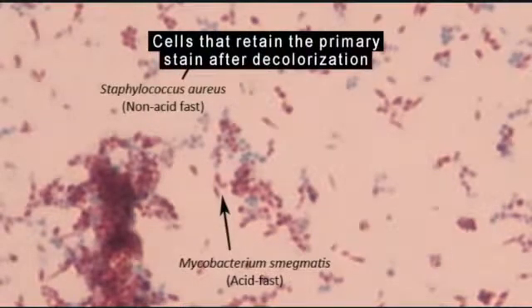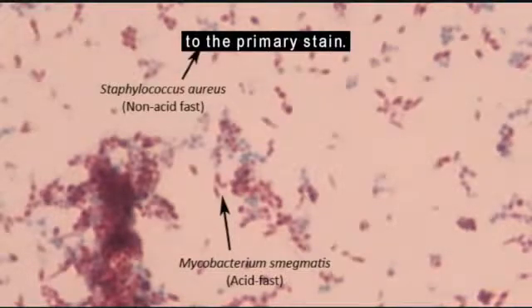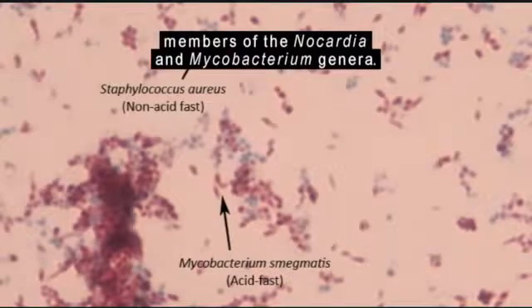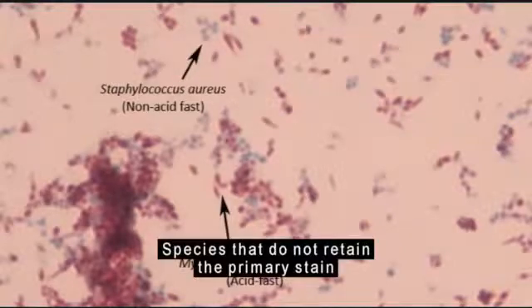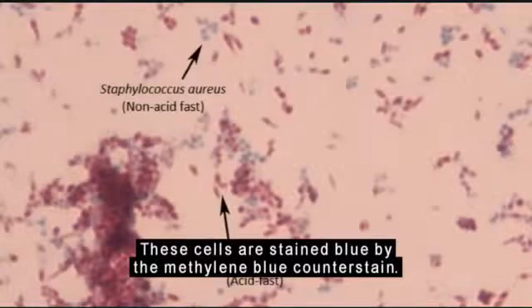Cells that retain the primary stain after decolorization are called acid-fast because they hold fast, or tightly, to the primary stain. These acid-fast bacteria stain red and include members of the Nocardia and Mycobacterium genera. Species that do not retain the primary stain after decolorization are called non-acid-fast. These cells are stained blue by the methylene blue counterstain.